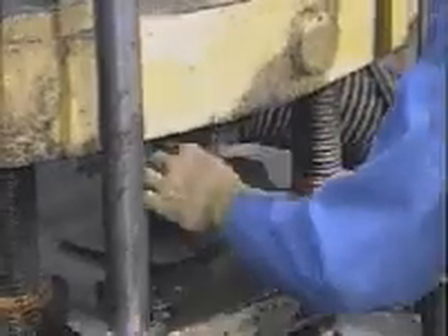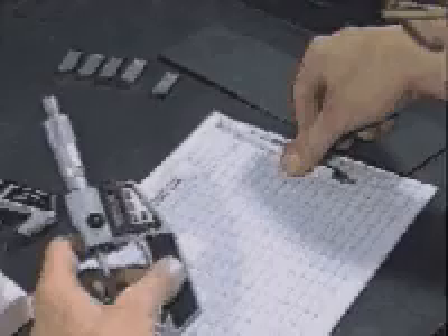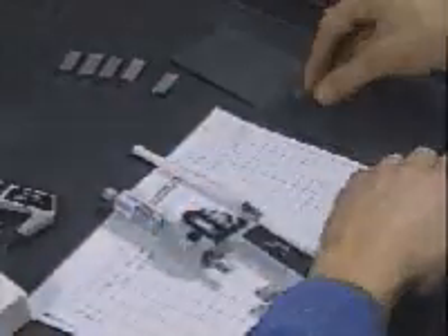The ejected compact is removed and its dimensions are measured to the nearest 0.0002 inch or 0.005 millimeter. The green compact is also weighed to the nearest 0.01 grams.